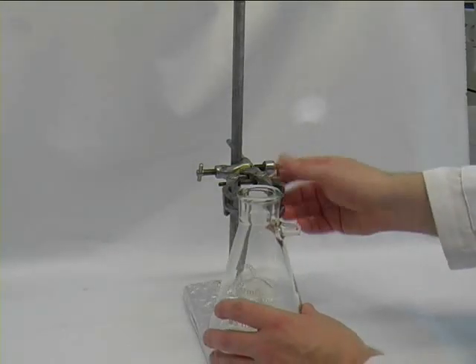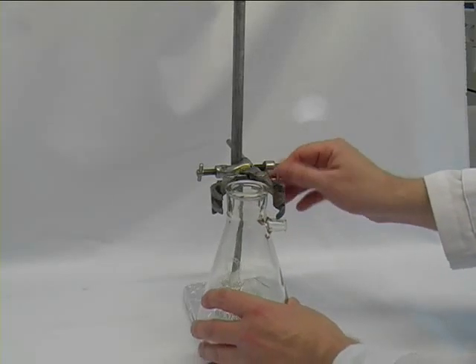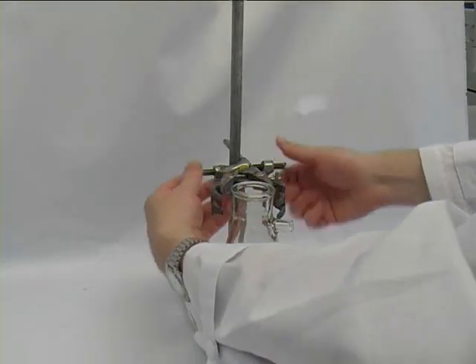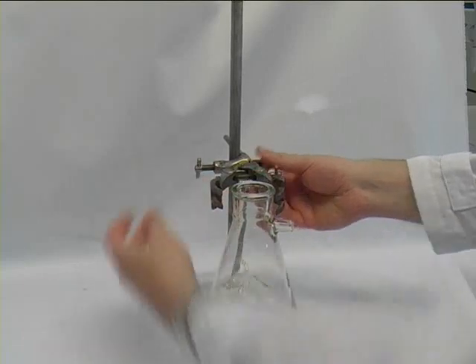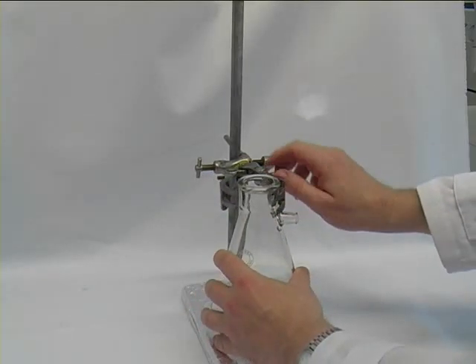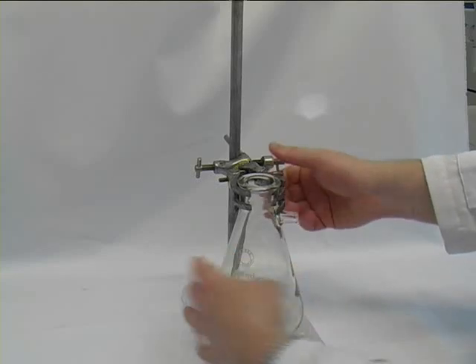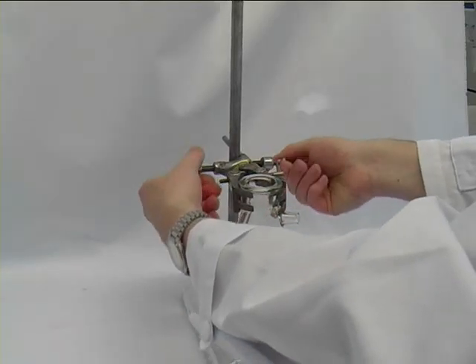That's our Büchner flask. That's a thick-walled conical flask, which we have to clamp into the retort stand in such a way that the whole equipment is above the plate. Otherwise, the whole setup would be unstable.